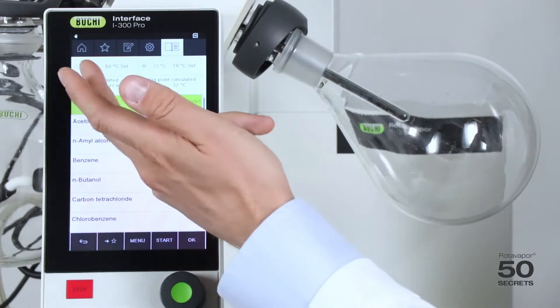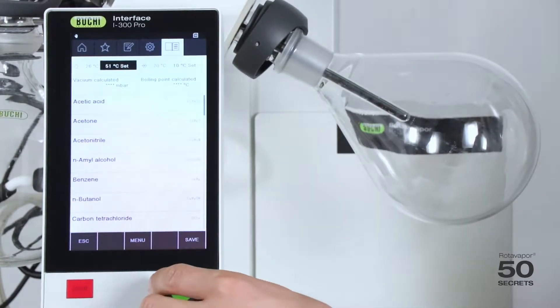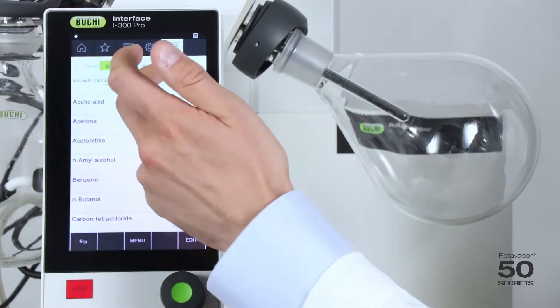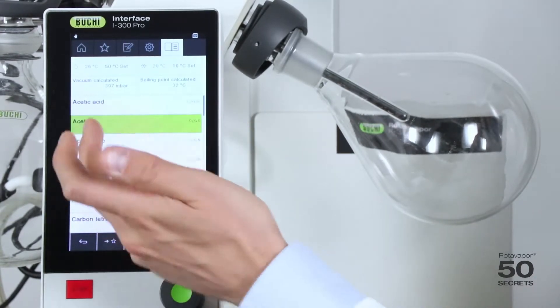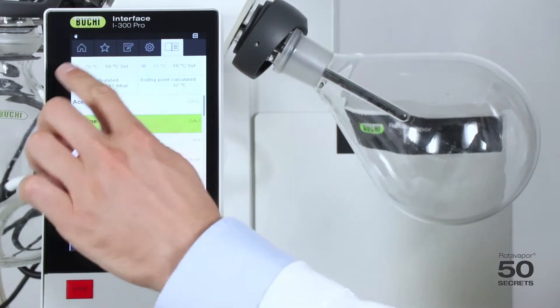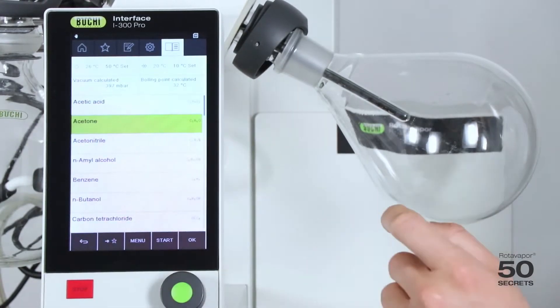And of the chiller. You can of course as well change it to a different temperature. Based on these two values and the selected solvent, a vacuum is calculated and a boiling point is calculated.